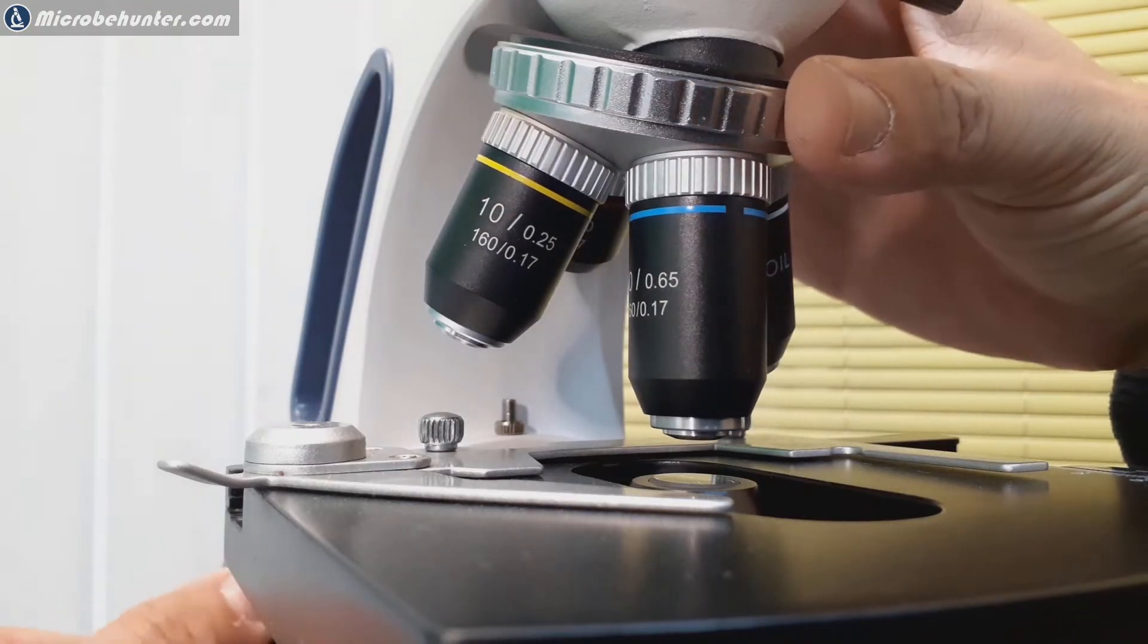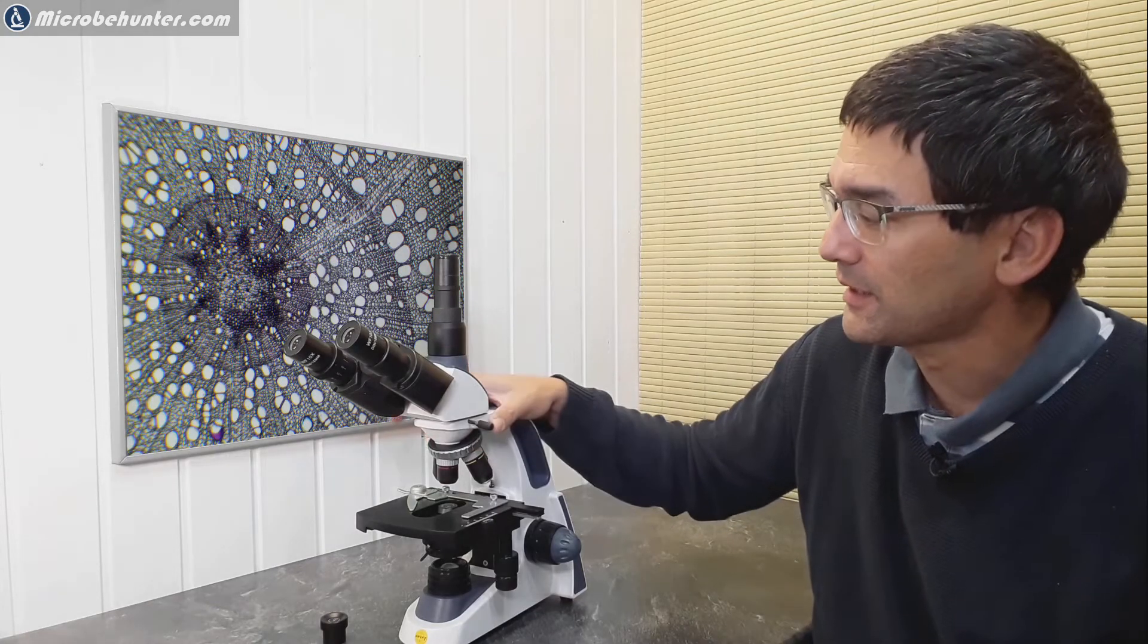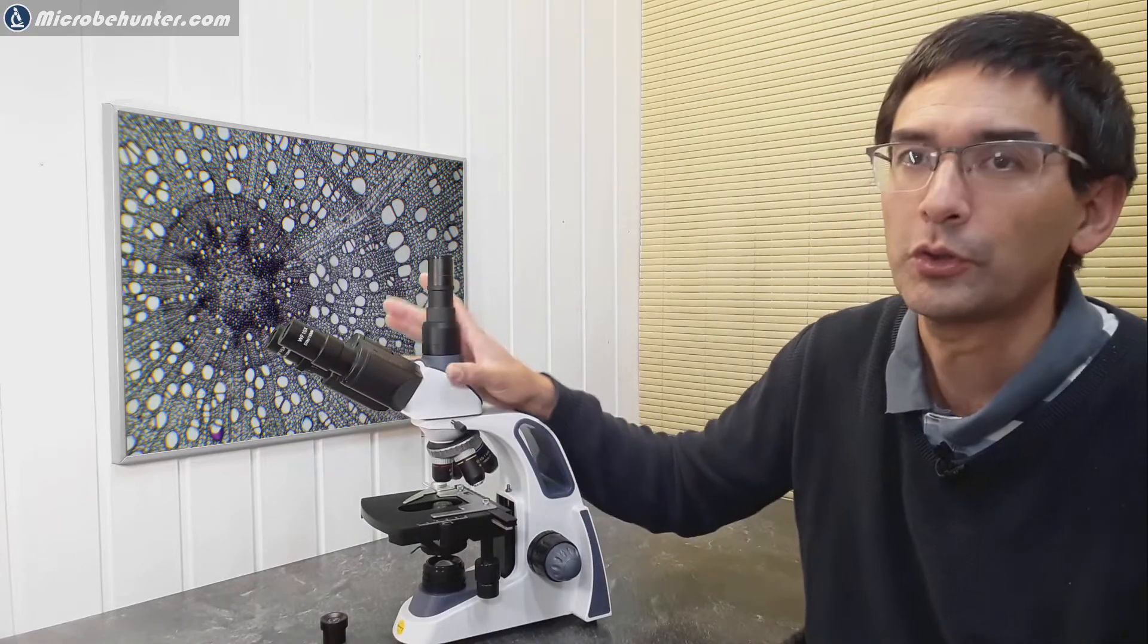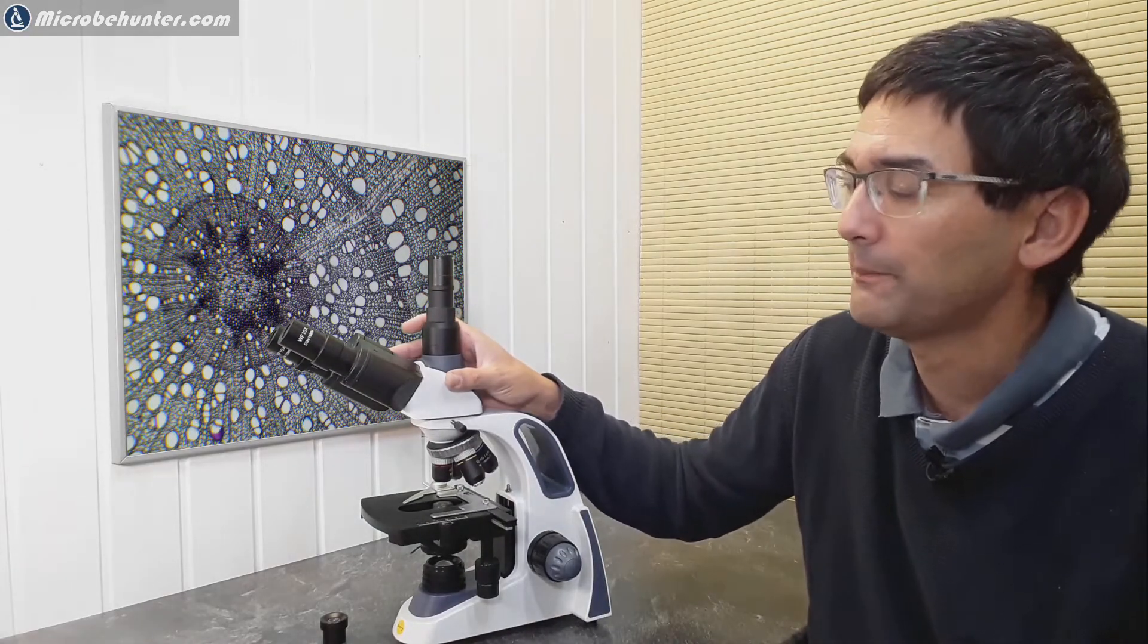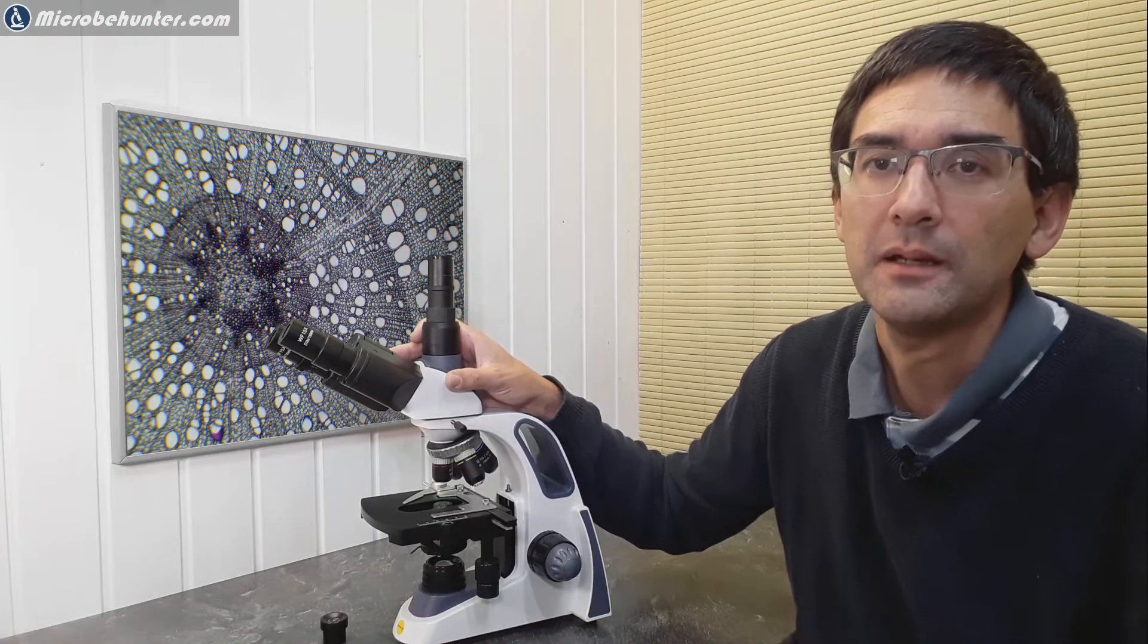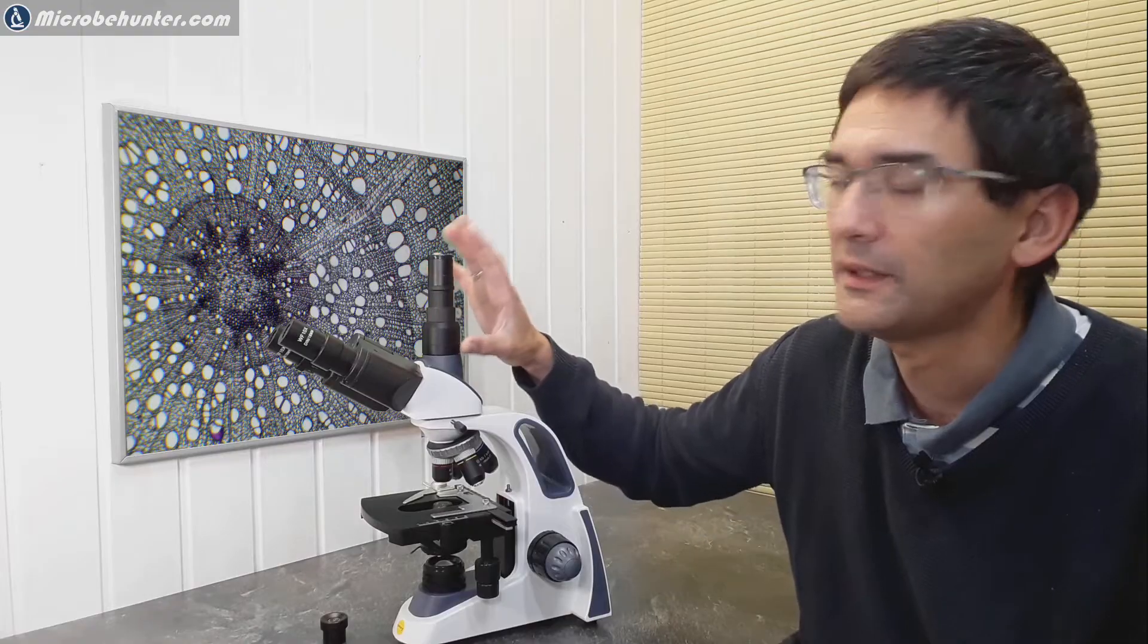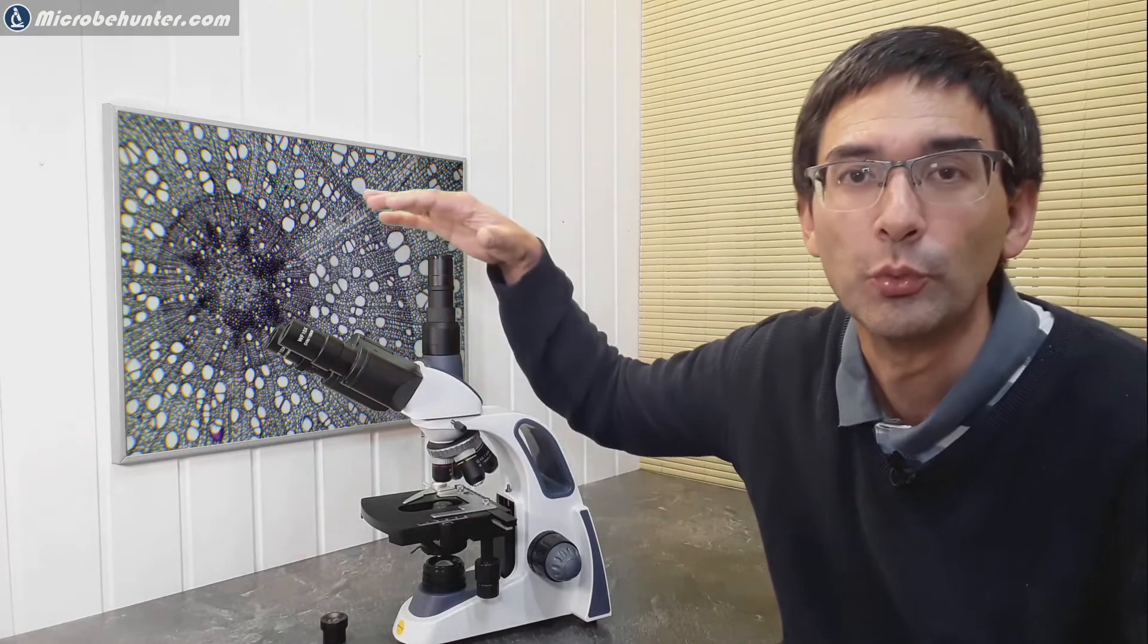What I've got here is the trinocular version of the microscope. The 380B is the binocular version, but I would actually recommend that you get the trinocular version - it's simply so much more convenient to connect the camera.